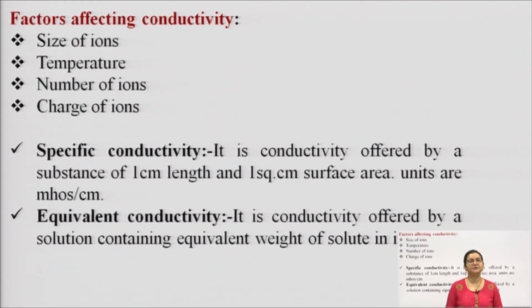So, temperature will definitely affect the mobility of charged particles or charged ions. The mobility of charged particles and charged ions, what is that? The conductance. Yes, my dear, the conductance. The conductance will definitely change, which will change the generated voltage, and that in turn will change the generated current or the current measured. So, temperature is another important factor which will change our conductivity.